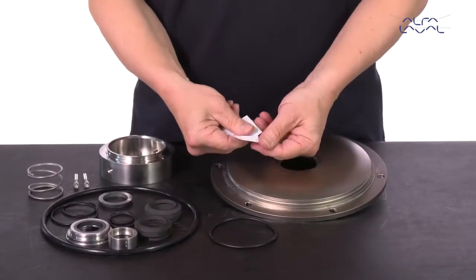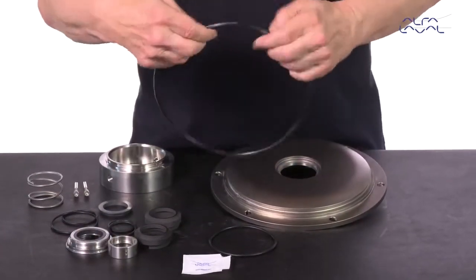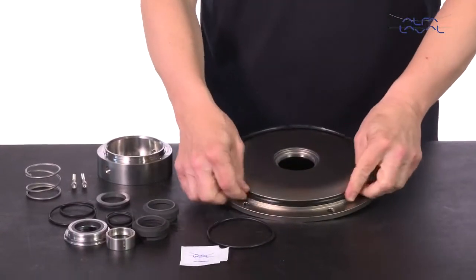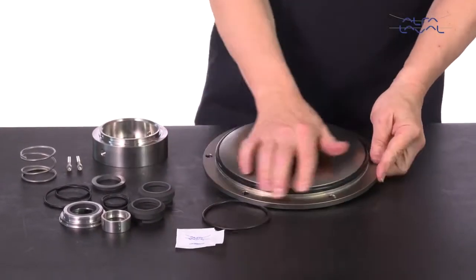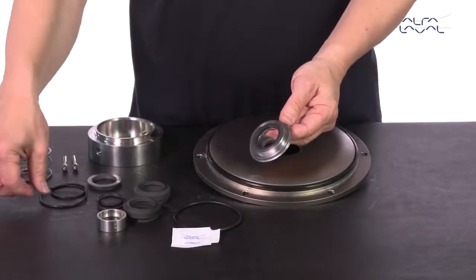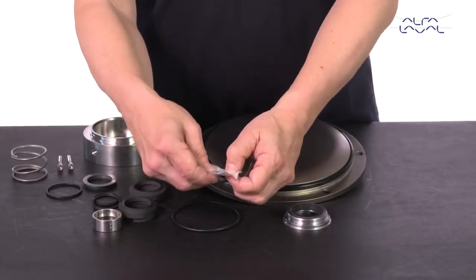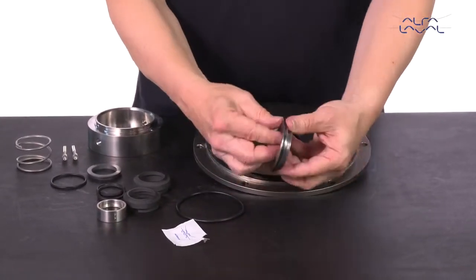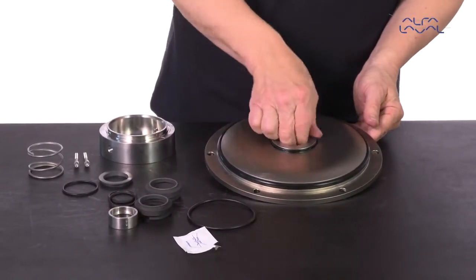Lubricate the o-ring and slide it onto the backplate. Lubricate and fit the o-ring on the stationary seal ring. Screw the stationary seal ring into the backplate.